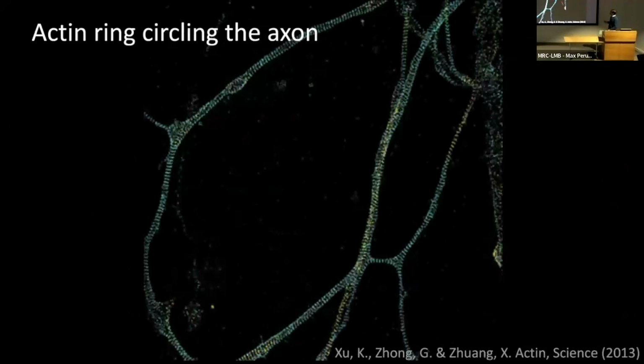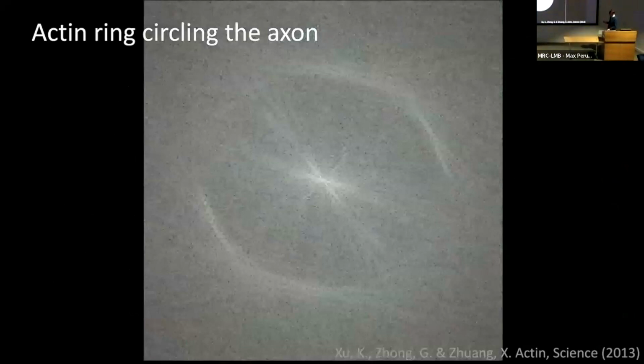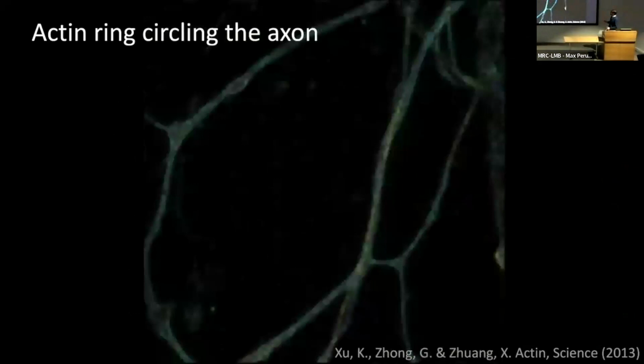If we take the same kind of image with a normal conventional microscope, we cut out everything outside, and we end up with no rings. So we don't know if there are rings or in which direction they are. We can't access this information. This leads toward the next presentation from Nick.